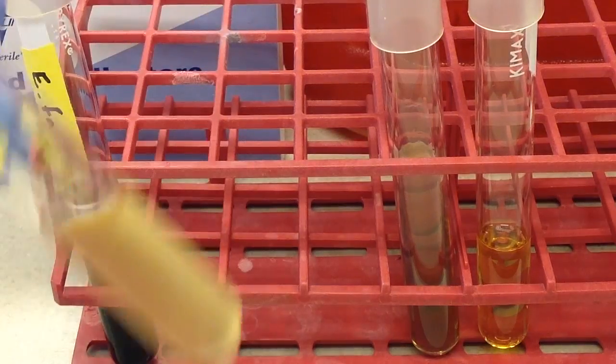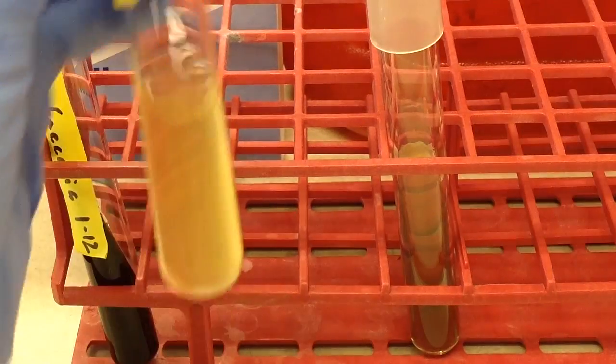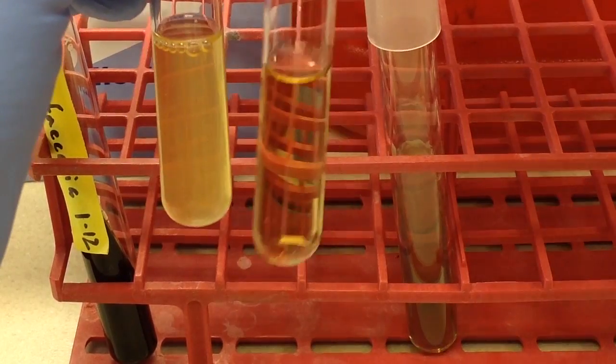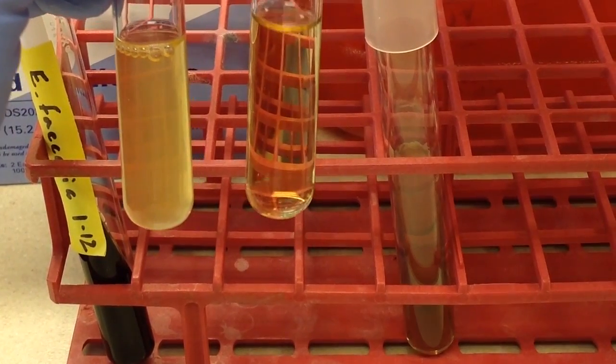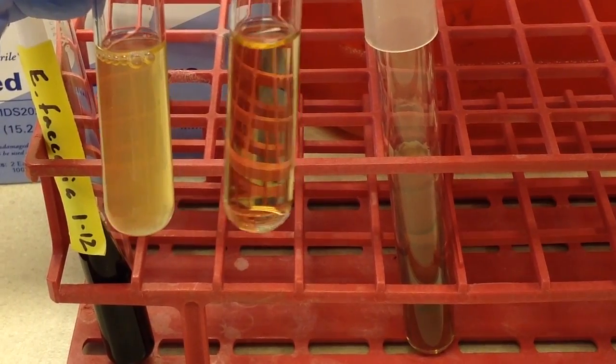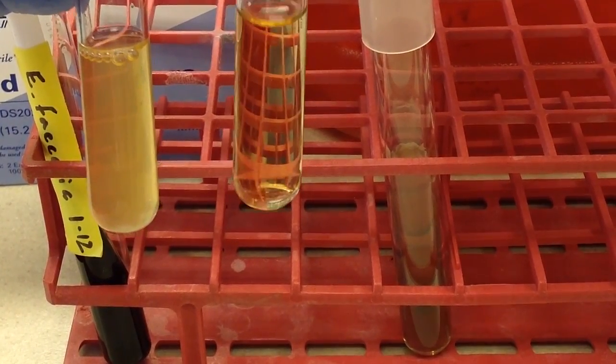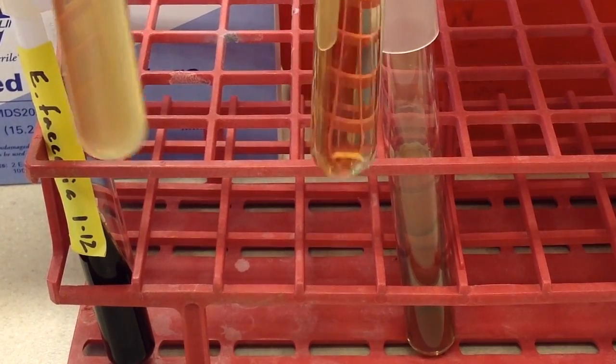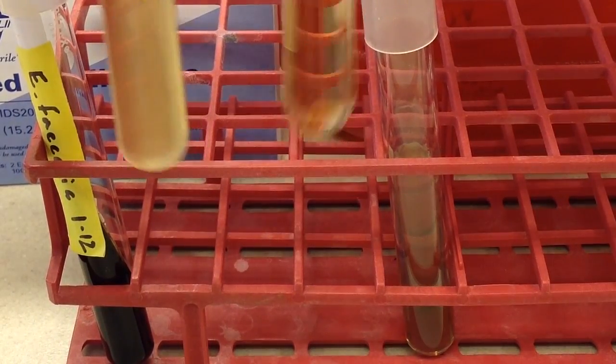Our 6.5% sodium chloride, what we're looking for here is simply growth. So, the one on the left is our Enterococcus faecalis, which grows in 6.5% sodium chloride. And the tube next to it is just an uninoculated tube, just to show you the difference between what a positive and what a negative is.